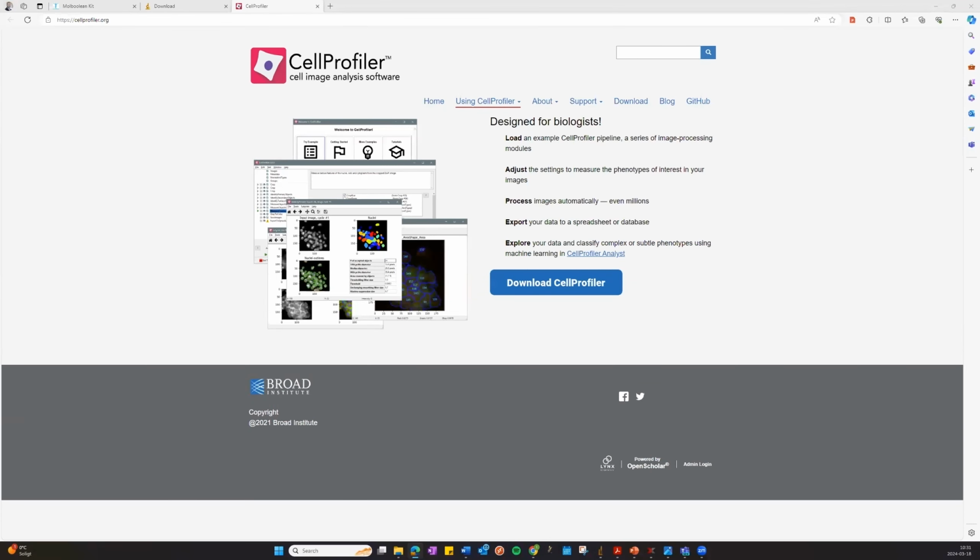Once image processing is finished, we need to perform image analysis. And image analysis is needed to calculate the fractions of free versus interacting proteins in the MolBoolean results. An important step in the image analysis workflow is to achieve a good segmentation of the rolling circle products. And we call the rolling circle products RCPs.